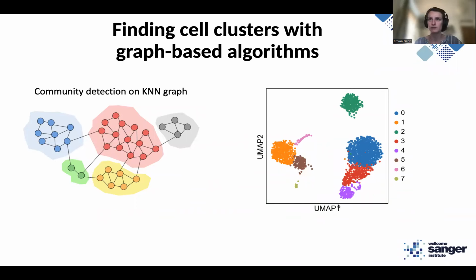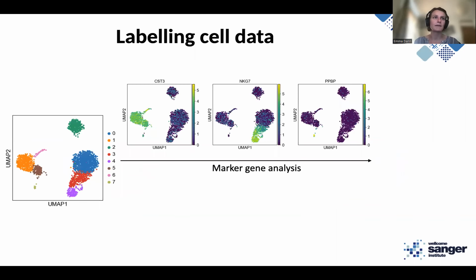And you see we have separated out what we thought were probably the NK cells before. And clustering is very useful. The idea is that clusters of cells often represent cells of the same type that have the same function. And as we've learned from analyzing many data sets, one of the most useful things you can do with single-cell RNA-seq data sets is going from this very abstract assignment of cells to clusters, which doesn't tell me much about the biology, to actually examining marker genes for your tissue of interest.